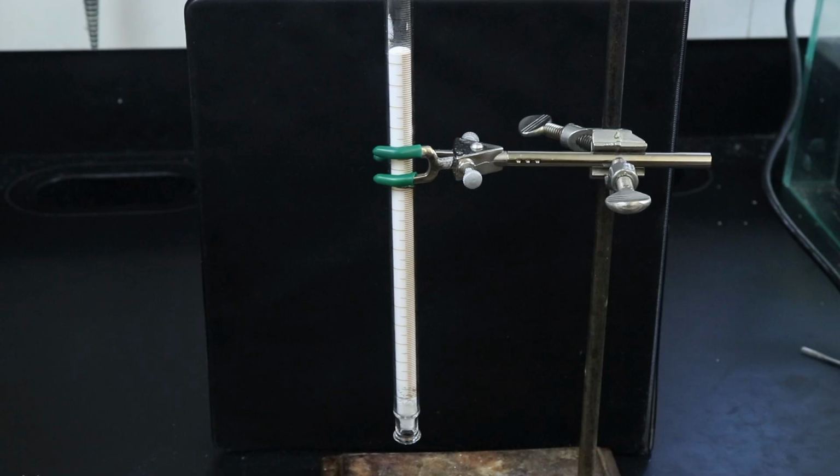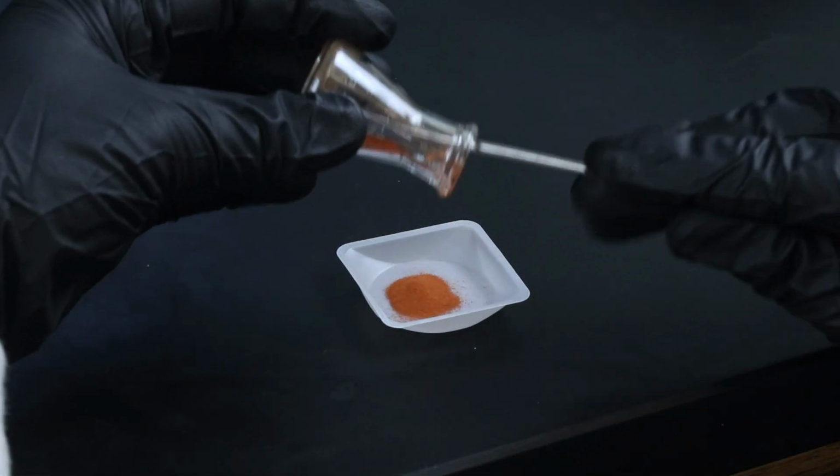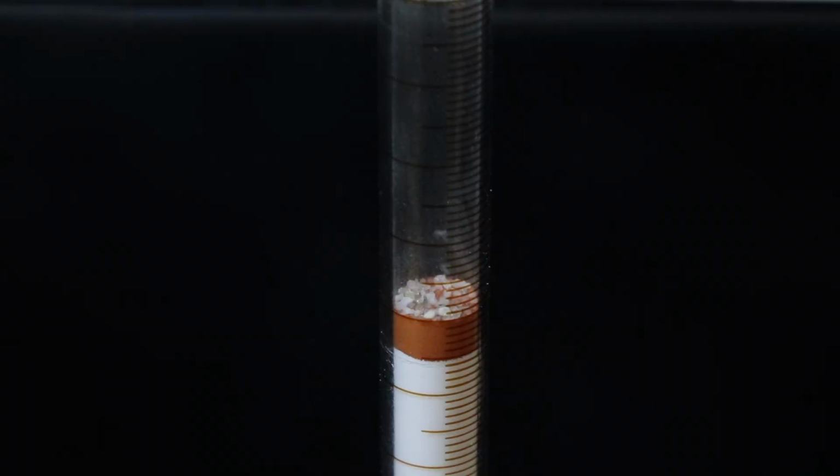Once the alumina is all set in the column, I can move on to adding the product on top of it now. And finish by adding another layer of Ottawa sand.